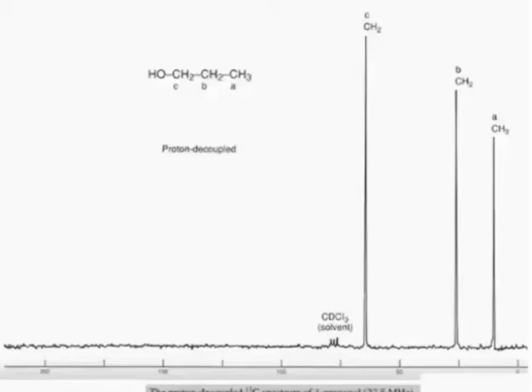However, when proton decoupling is carried out in C13, as it normally is, something interesting happens. There's a phenomenon called the nuclear Overhauser effect. Because of this effect, we actually lose information. There turns out to be no longer a relationship between the number of carbons in an equivalent set and the size of the signal.